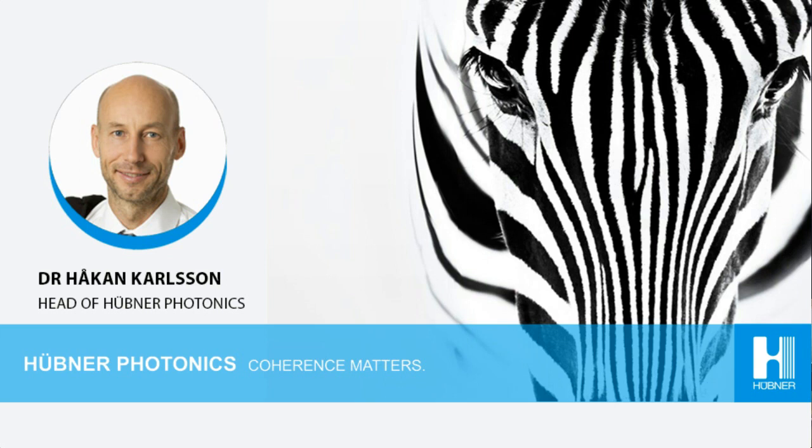So we see a lot of more increased use of visible lasers for different types of enhanced Raman spectroscopy techniques like SERS and TERS on carbon materials. We see an increasing trend to use shorter wavelength lasers in the UV to avoid the autofluorescence. There is also to some extent an increased use of 1 micron laser with newer types of InGaAs detectors, which have become better. So there are trends in all directions, I would say.